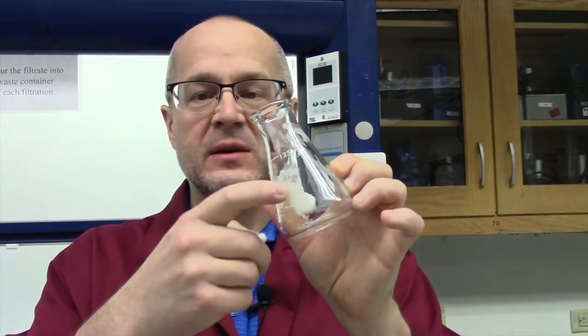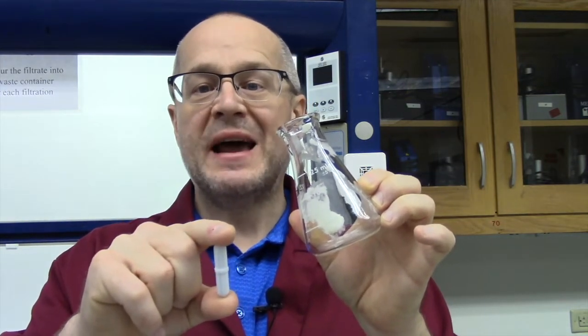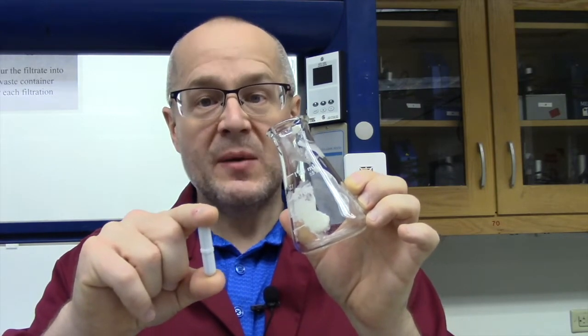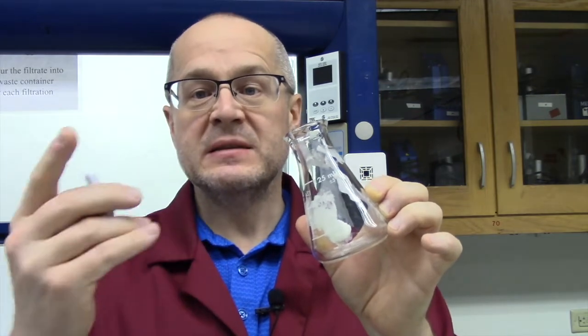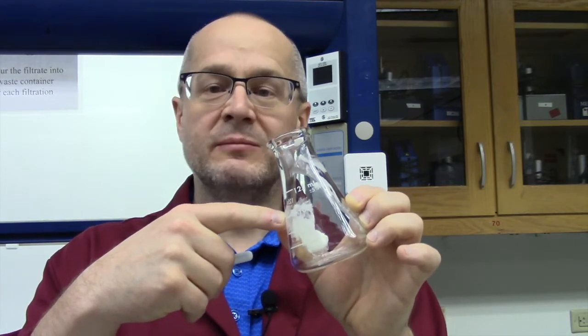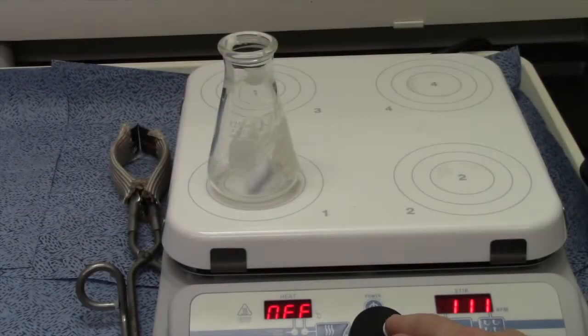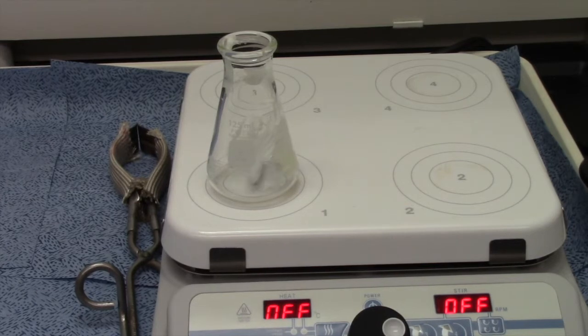Now that we have the fat in our flask — you can see the nice Crisco right there — we're going to put this little white bar into it. This white bar is a Teflon-coated magnet. We have a stirring hot plate that has a magnet underneath on a motor that spins, causing the magnet to spin in this little Teflon coat, causing it to stir my reaction so I don't have to stand there stirring manually. The Crisco is very sticky so the stir bar has a hard time moving, but once we start heating it and have everything added, it'll start moving quite freely.